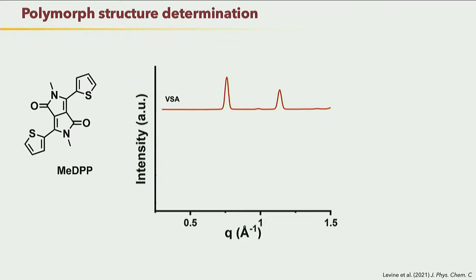We had this molecule here. It looks like this. This is from the same group from New York we worked on in the first sample. They deposit on the grid, and they make thin films. This is kind of standard how they work. They deposit it, let it dry on the grid. That makes crystals. And then if they do what they call vapor solvent annealing, so they anneal it with another solvent and let things recrystallize and reform, they get very nice, clean powder diffraction patterns right here. Very nice kind of single crystal pattern.